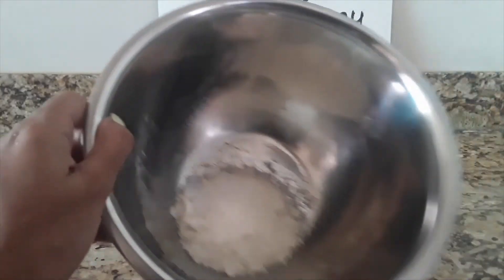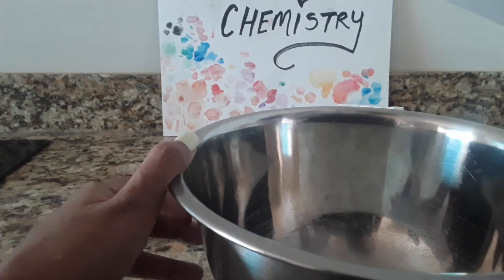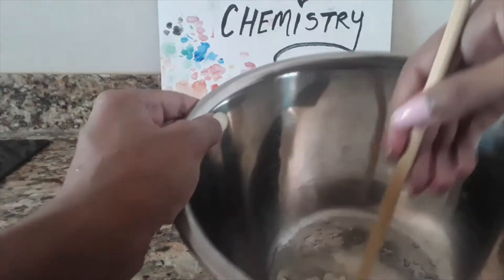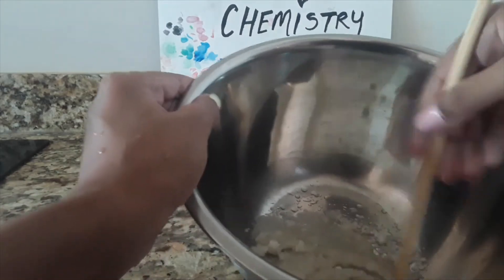So now that we're done with that, we can get to purifying our powder. Let's add ice-cold rubbing alcohol to our nice white powder and mix it around — ice cold, since it dissolves some of the impurities, because sodium acetate dissolves in water.